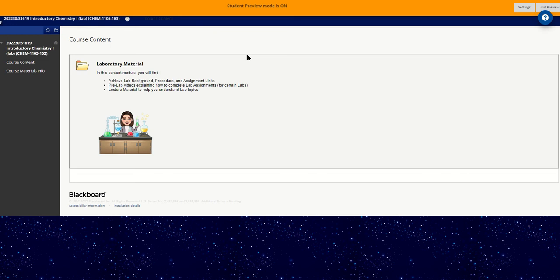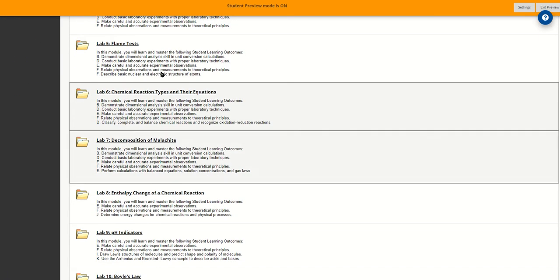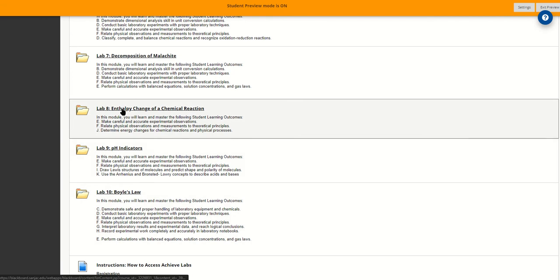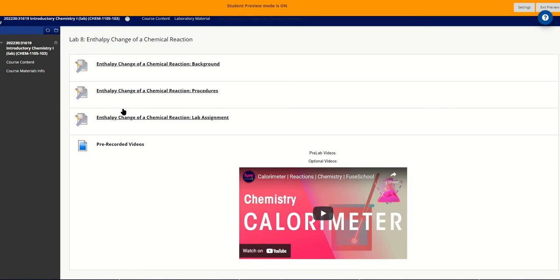Hey y'all, so in this video we will be discussing the calorimetry lab. So once again, you will be entering your 1105 Blackboard site and then enter lab material. And then we have lab 8, which I know I've said calorimetry. The proper actual name of this lab on Achieve is enthalpy change of a chemical reaction, but calorimetry is the technique we are using, so that's why I mentioned that.